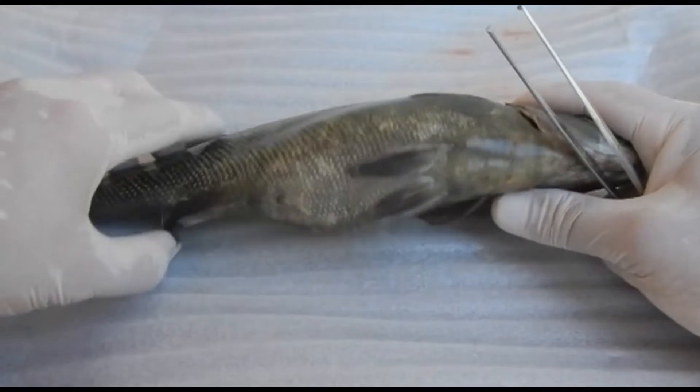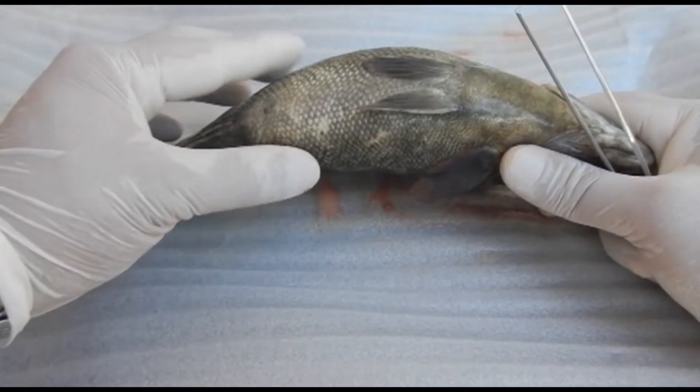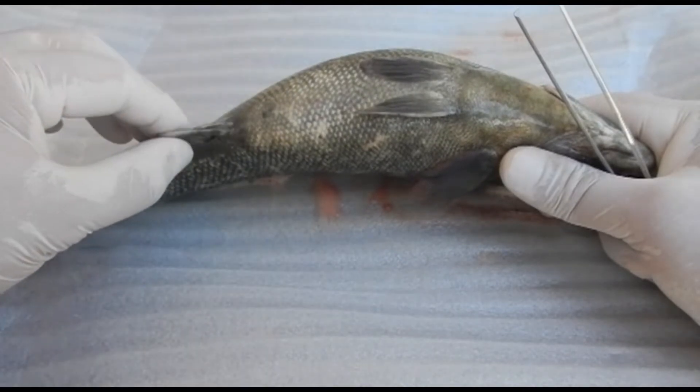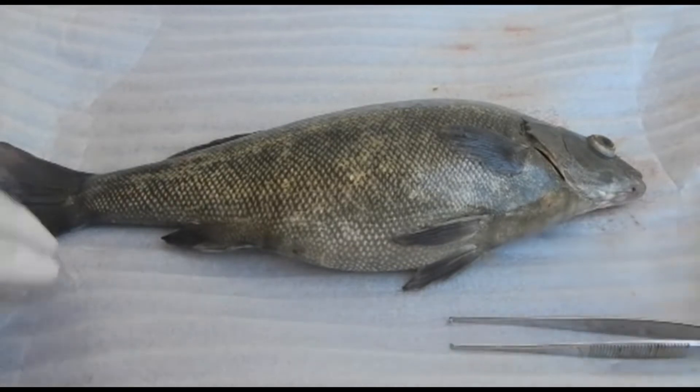Now we want to turn the fish to the side, look at the bottom, and examine the vent especially. It should not be protruding and it should not be red. It's very important to check this area for evidence of bacterial enteritis.